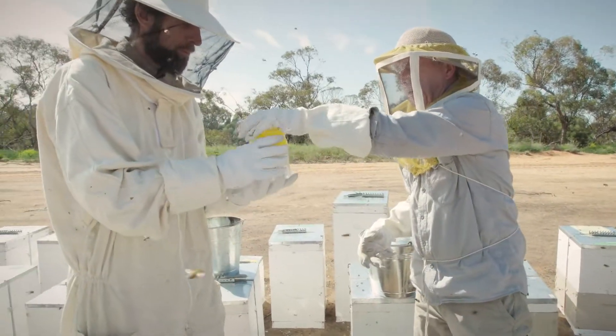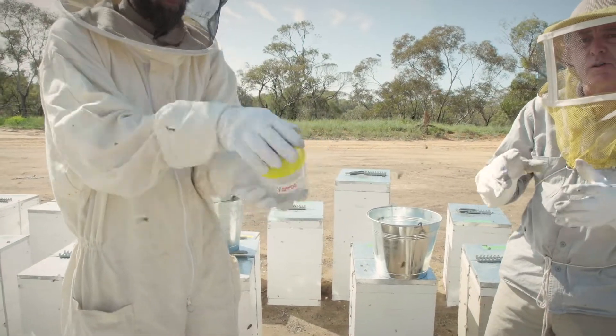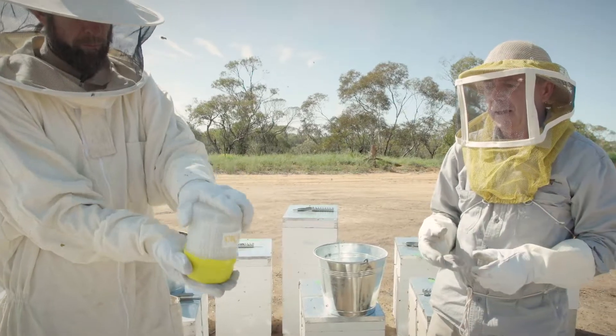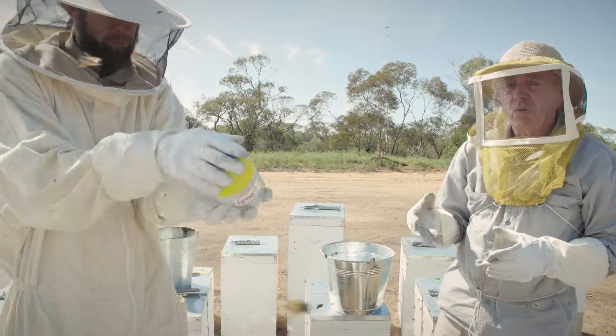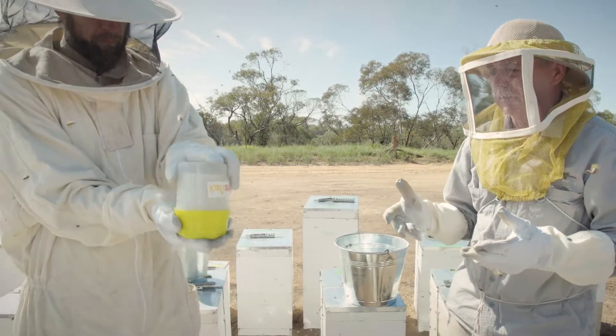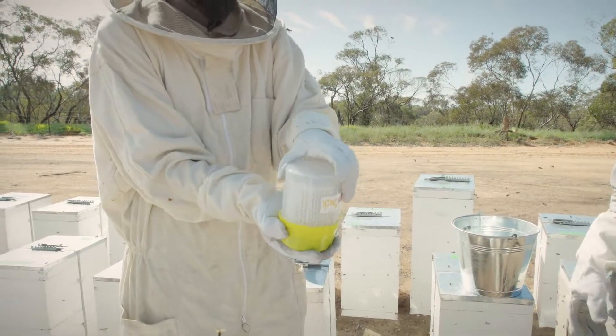The next step is to upturn it, mix it, and make sure that the bees are totally covered in alcohol — it kills the bees on contact. Give it a good shake to dislodge any parasites like varroa mite or Tropilaelaps from the bees themselves. A good shake for about 20 seconds should dislodge anything that's there.